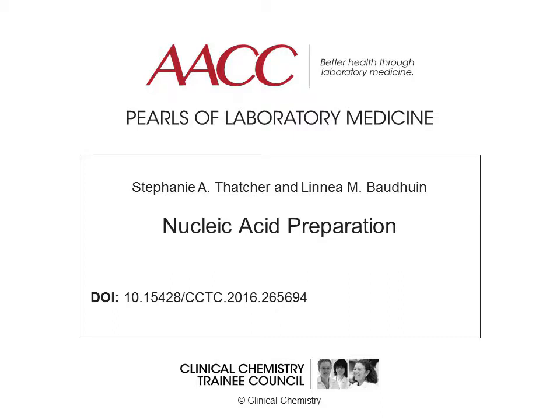Welcome to this Pearl of Laboratory Medicine on nucleic acid preparation, authored by Stephanie Thatcher and Linnea Baudhuin. The purpose of this talk is to present basic techniques used to prepare DNA and RNA for molecular analyses. With many procedures and products available today, a good understanding of the basic principles of nucleic acid preparation can help guide selection of the best procedure for your application.